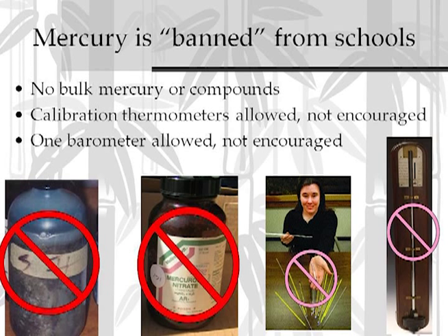Our experience is that almost none of these mercury barometers are actually actively being used by teachers, and they do have a lot of mercury in them. So we recommend that your school not have mercury barometers in them. And mercury thermometers are still common, but it's very easily substituted for.